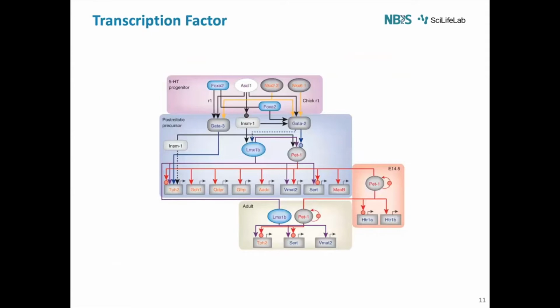You can also do transcription factor enrichment analysis or use that as a pathway. So I know that this transcription factor regulates all those proteins. In that case, that is also an enriched term that can be taken. Instead of having inflammatory response, I will see GATA3 is enriched in my data set because many of those genes are upregulated in my data set.